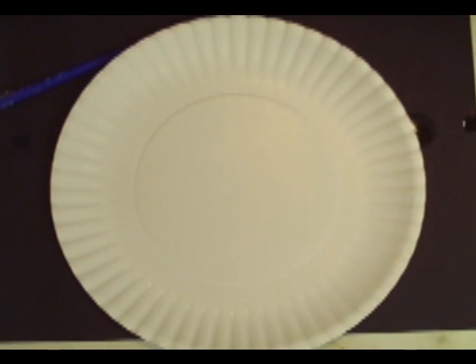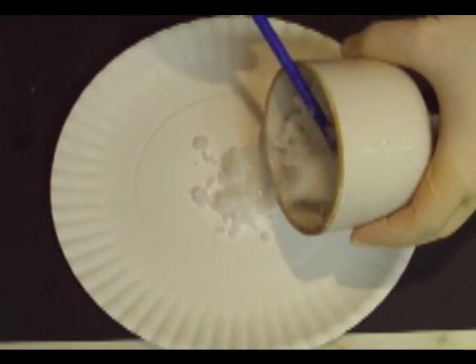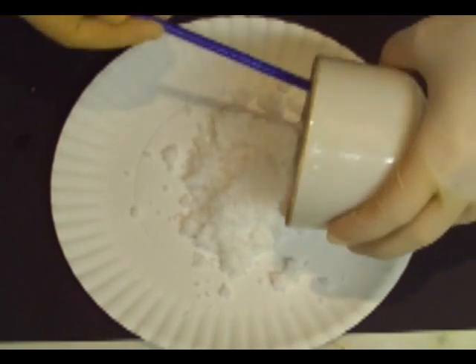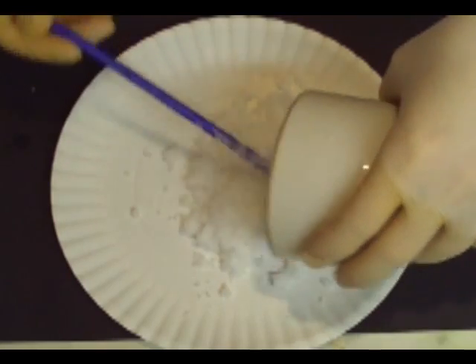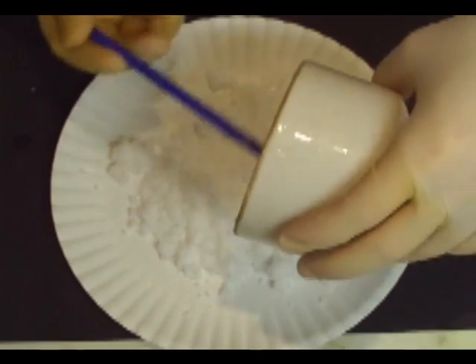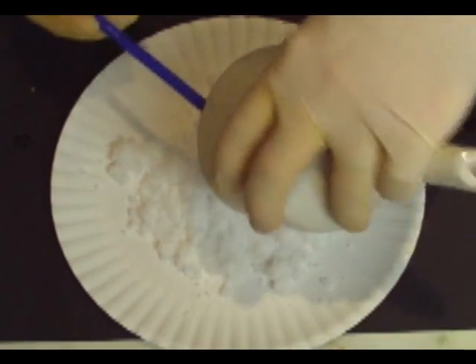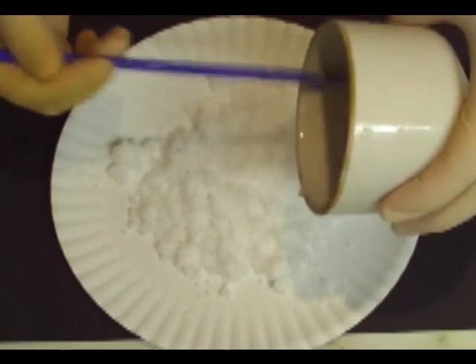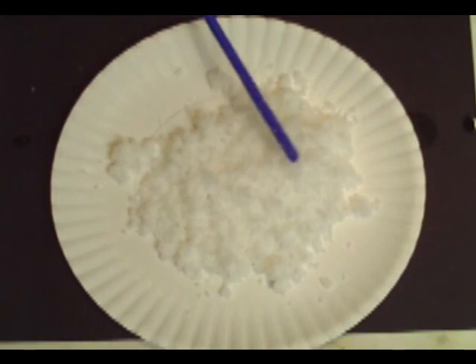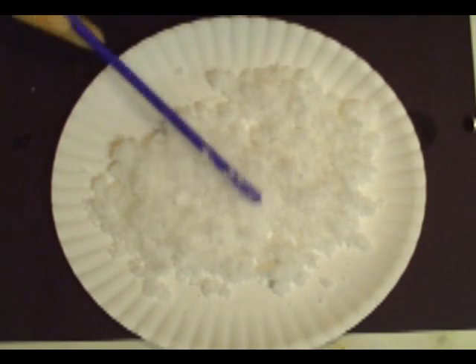I use paper plates to dry my crystals on, just because the paper plate tends to soak up some of the water, which seems to make it dry a little bit faster. Go ahead and take your filter flask and put your crystals out — you can use a watch glass or a glass bowl or whatever you like. Get them all out, spread them out, and then put them somewhere to dry.